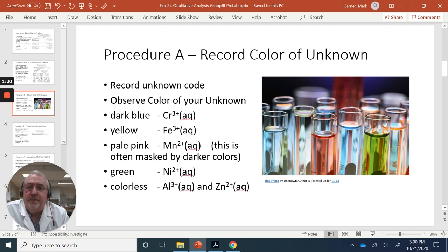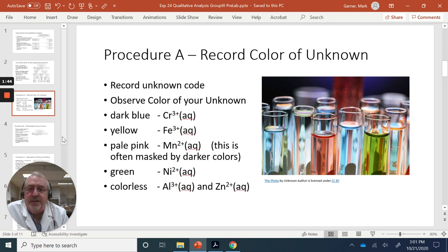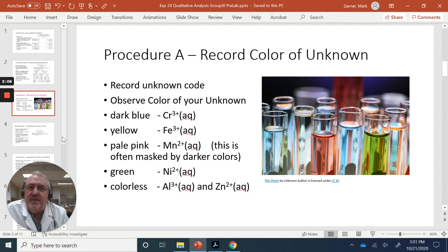The first thing you want to do is look at the unknown color in the test tube that Professor Hammond will have. Look for evidence of ions based on the initial appearance of the unknown mixture. If it has chromium, it could have a dark blue tint. Iron(III) gives a rusty red or yellowish tint. Manganese has a pale pink, often masked by other colors. Nickel can have a pale green color. Aluminum and zinc in solution are colorless, giving no hint of their presence.